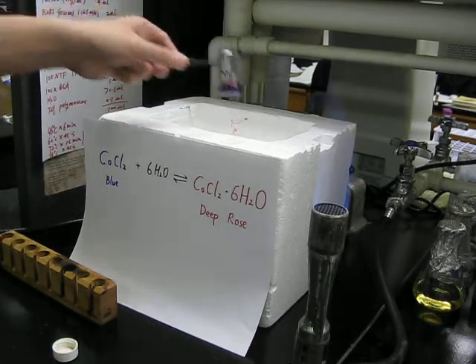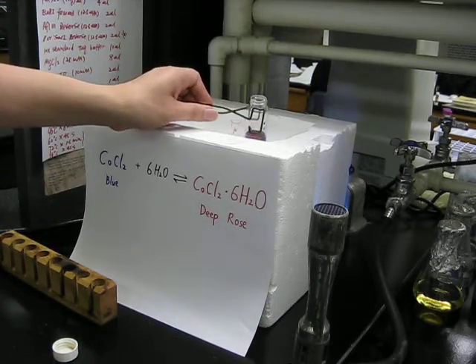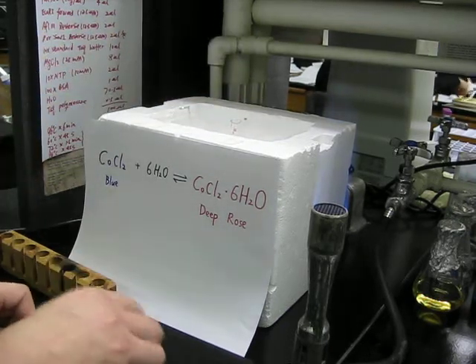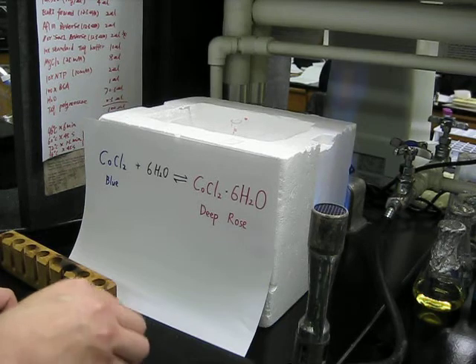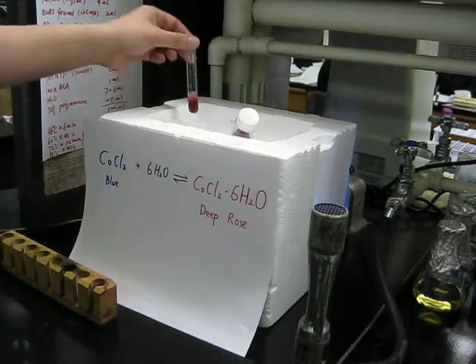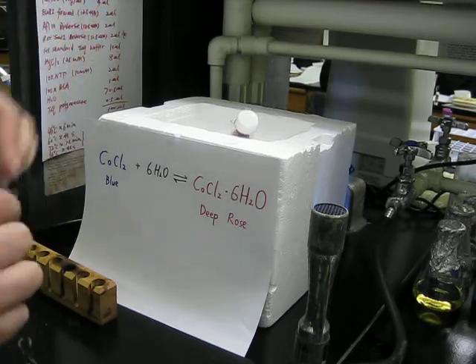Okay. So now we can put aside. Hopefully, put on the ice. Hopefully it will not crack. Let me cover it. And then let's check what happened for the ones that I put in the ice.